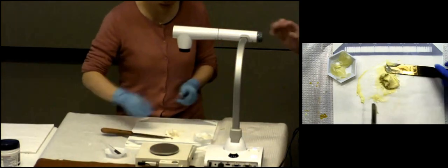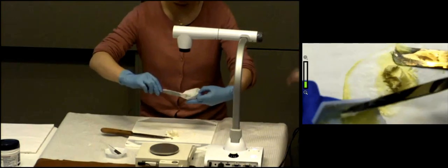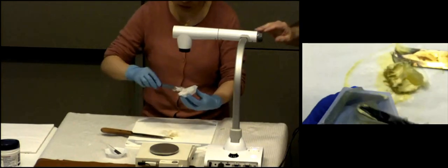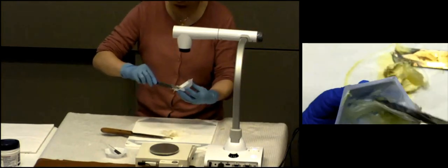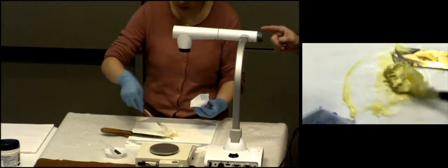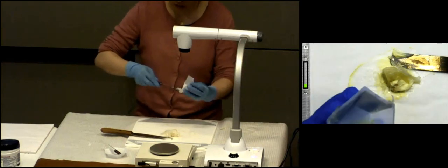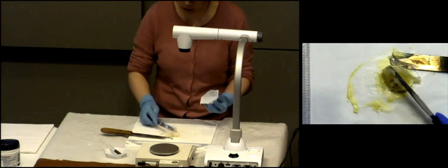All right, so let's add one more addition. Okay, I wanted to get everything out from my weigh boat, because if I don't, that is considered part of my loss as well. All right, so I wanted to get as much out as possible.